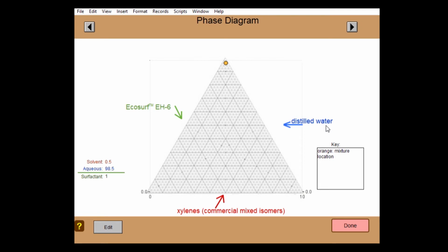What's really nice about this is that you could take any aqueous system that you design in the MCP and substitute it in here, because with the molarities that we're working with, those really small molar amounts, which is usually 0.05 molarity of our buffers and chelators, that's really not going to make a huge difference. Be aware that for ionic surfactants, that can make a big difference, especially with salt contents. But here with EcoSurf, it's a non-ionic surfactant, so we don't actually have to be concerned with that too much.